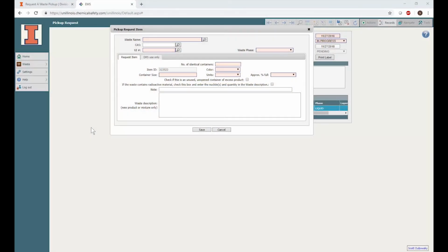If you cannot find your compound after searching, or if you have a mixture of components not yet in our database, select UI number 1 for New Chemical in the search box. If you are submitting a new chemical or mixture, you must include additional information in the notes box. Include the chemical name or CAS number if the compound is known. If it is not known, provide a name or link to a chemical structure. Safety data sheets are also extremely helpful. Finally, provide an estimate of the concentration of each component in the mixture. This includes water.